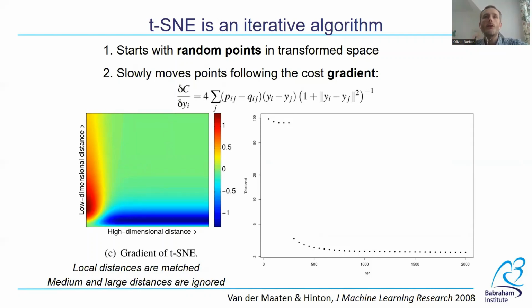Carlos's insight was that we could use this Kullback-Leibler divergence on a point-by-point basis to get information about the probability distribution of the tSNE representation. The local distance differences will correspond with differences in the probability distribution, and also differences in the distribution of distances in the tSNE representation space. This difference in distributions or entropies between the original data and the tSNE representation of the data serves as the basis for the cross-entropy test, the statistical test.